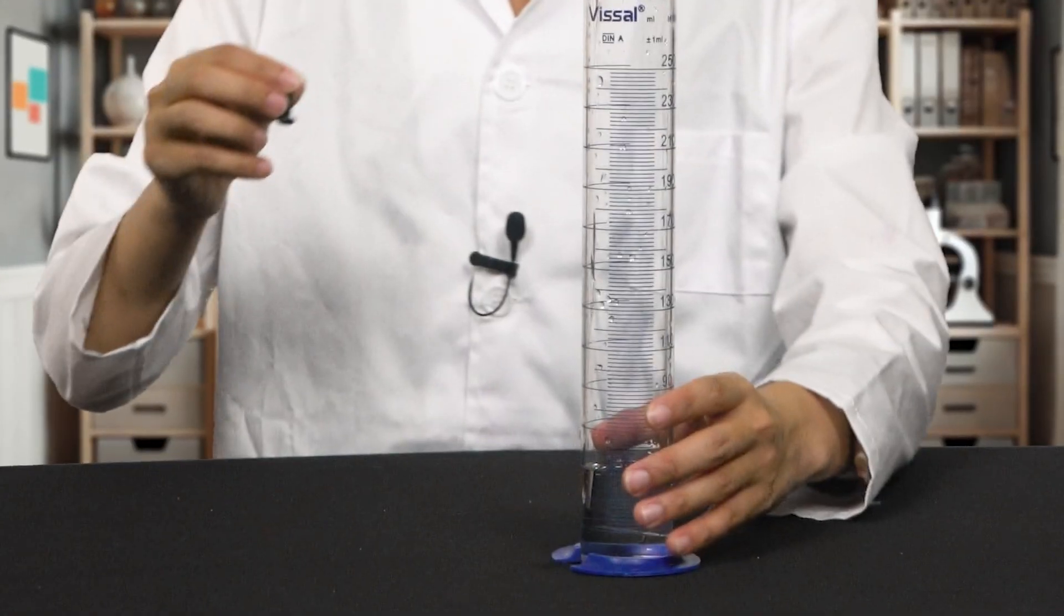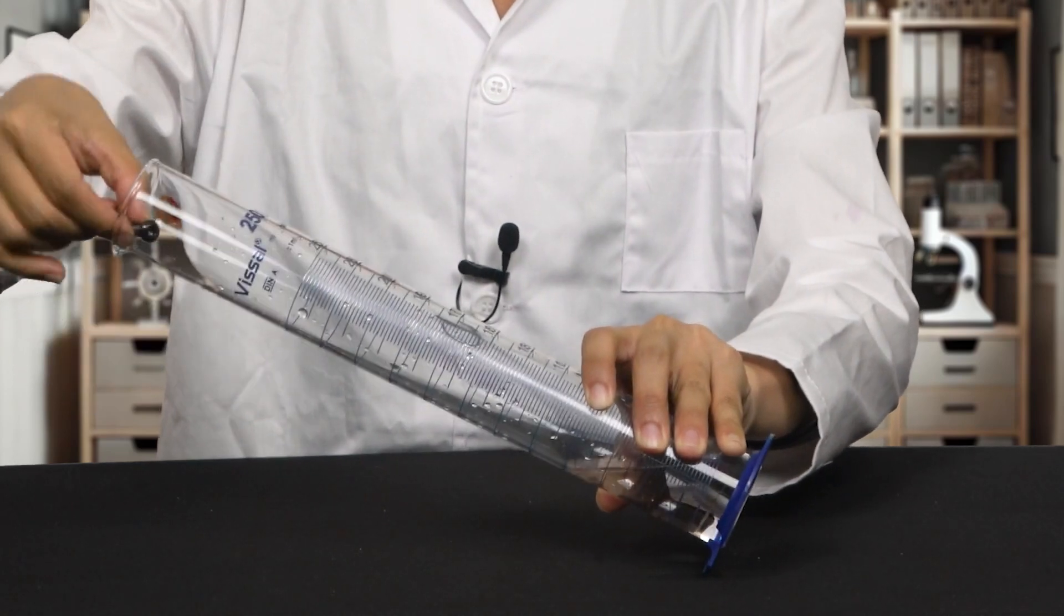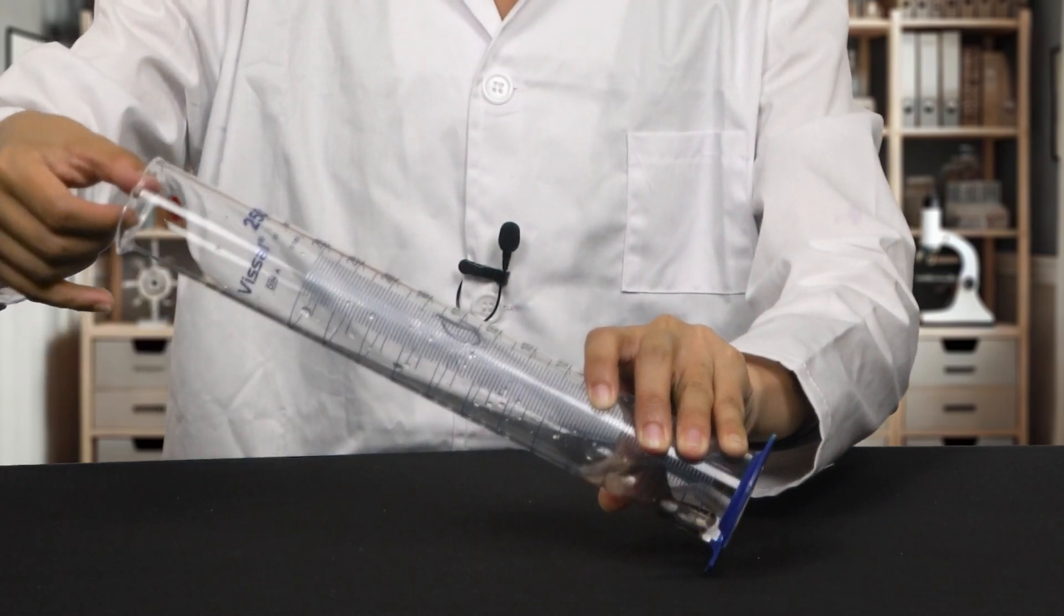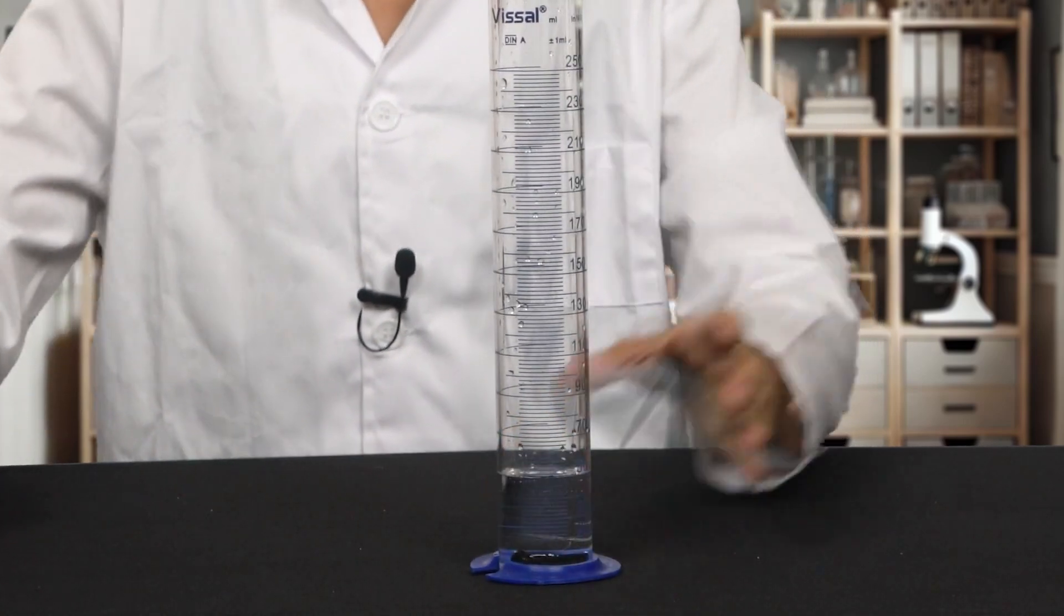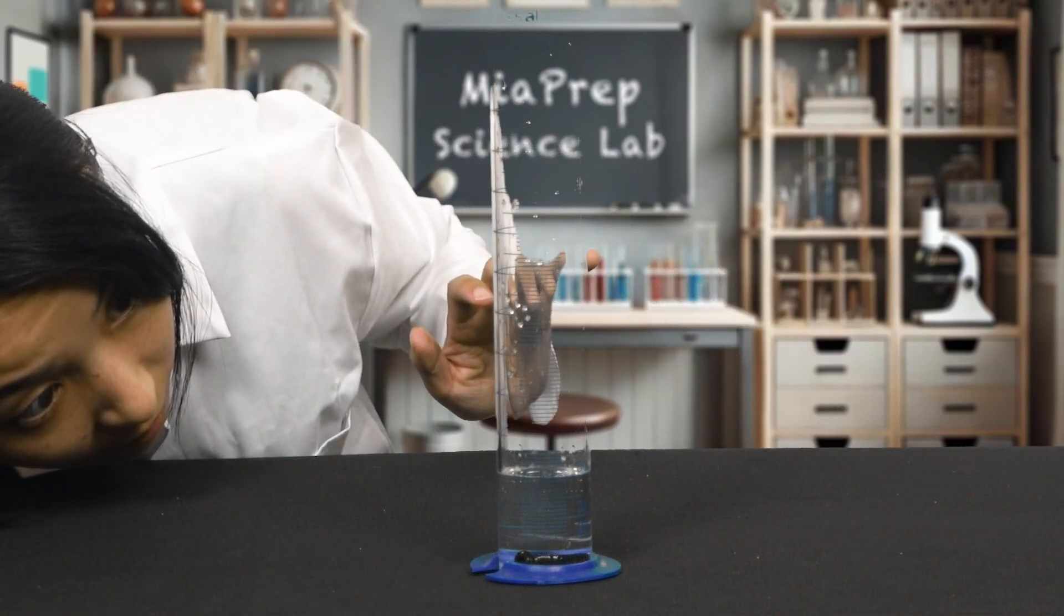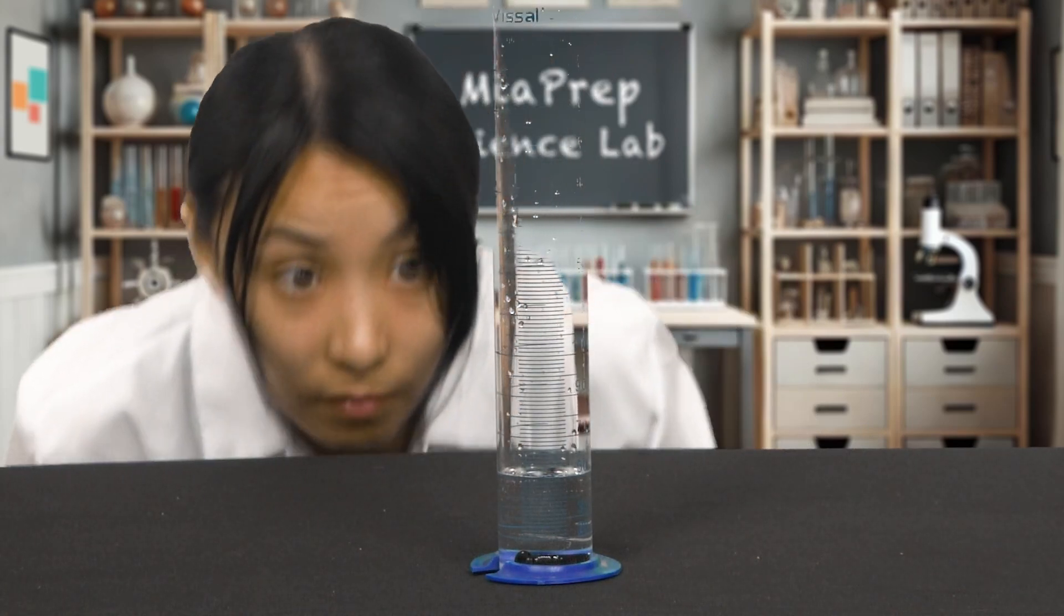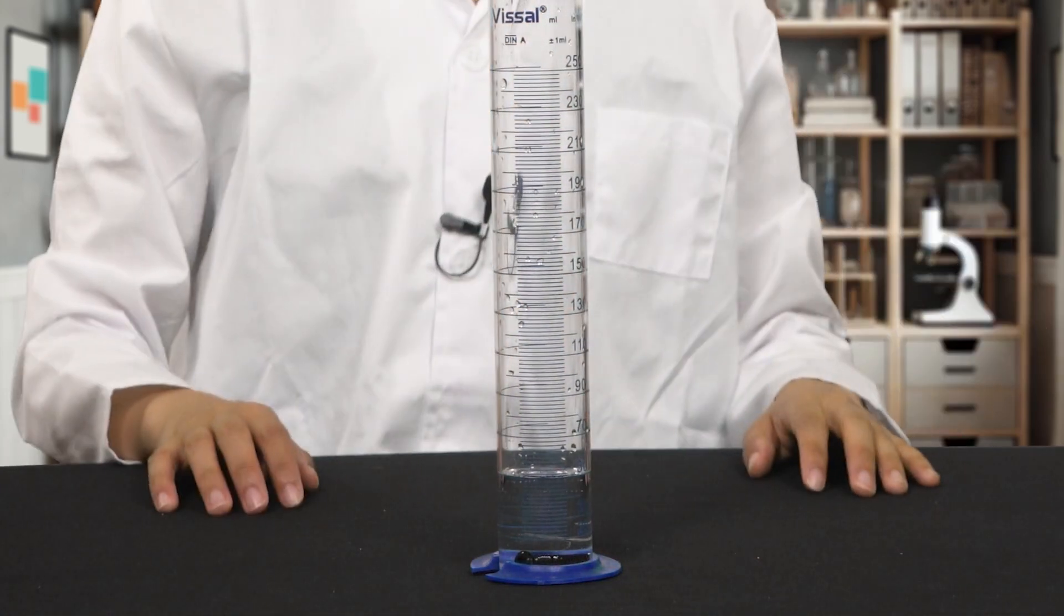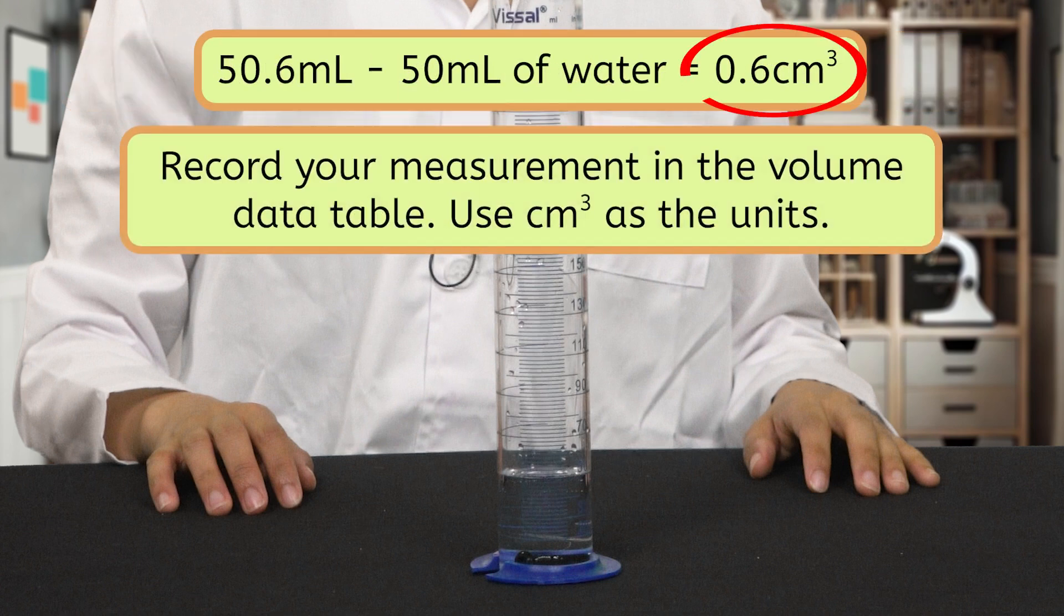Start with your graduated cylinder full of 50 milliliters of water. Tilt your graduated cylinder slowly without spilling any of the water. Then carefully place your item inside and let it gently slide to the bottom. Be careful not to let any water splash. Return your graduated cylinder to the table and look at the water line from eye level. The water level will be higher. Record the new water level after your object is fully submerged. To find the volume of the object, subtract the initial water level from the new water level. Record this number in your data table and record the units as cubic centimeters.